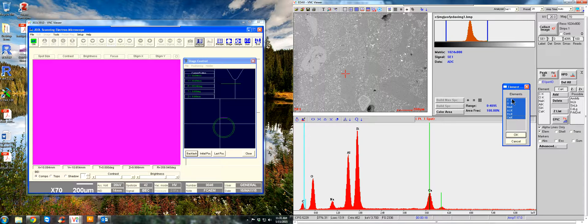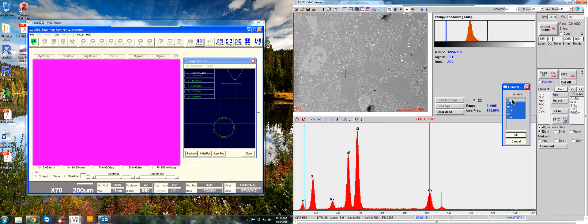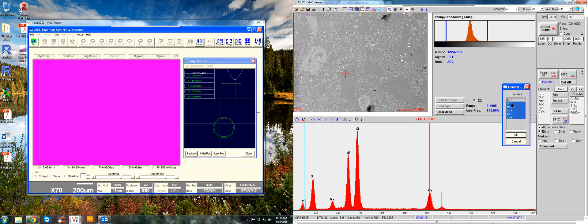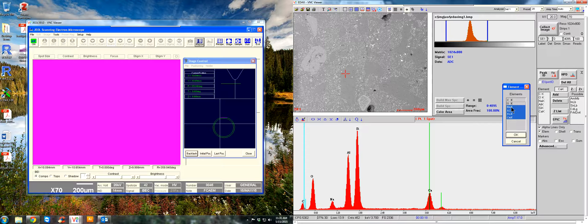Now, we don't want to include carbon because we know that we've coated the sample with carbon. And it calculates the weight percent based on oxygen. So let's not include that. So then just leave these elements on your Z-list and we'll hit OK.